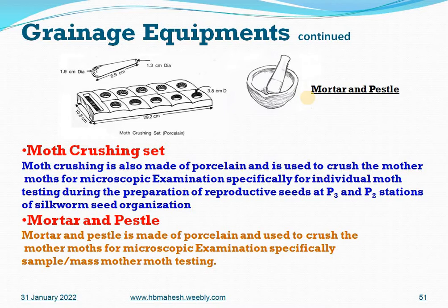Moth crushing set or moth exam set, these are used for mother moth examination. One is meant for the individual mother moth examination. Normally, this mortar and pestle is used for the mass or sample mother moth examination.